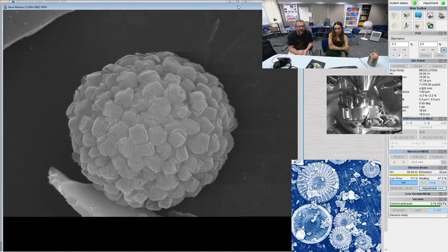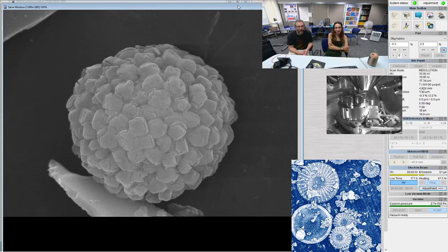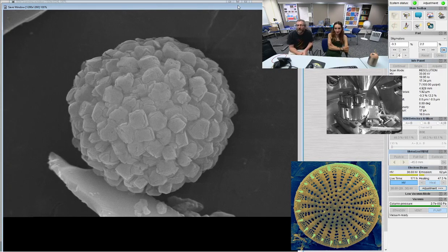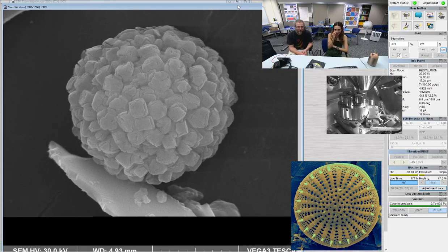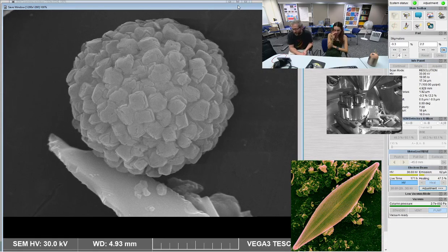Yeah, I don't know what that is still. Very weird, very round. It's a sphere. Spherical, a perfect particle. I would guess chrysophyte, just because it's a very round sphere. I'm going to go with chrysophyte, but I don't see a pore. So, I don't know.